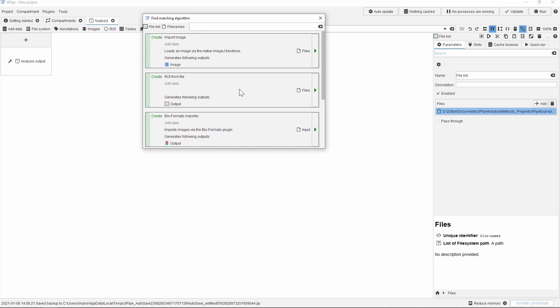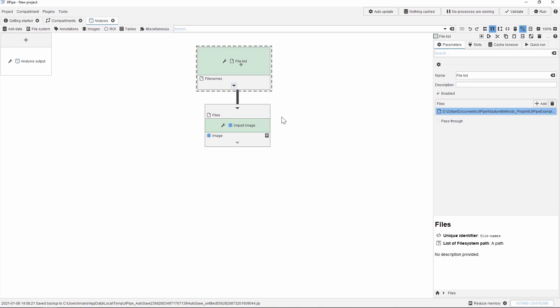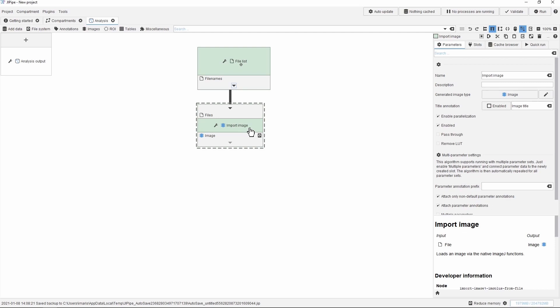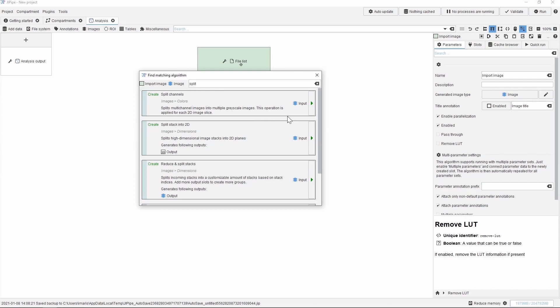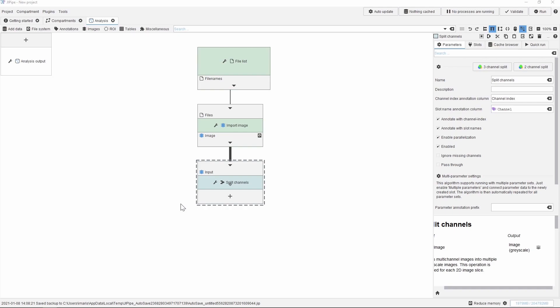When we click on the arrow bar, it will automatically also connect this new node to the previous one. In the next step we have to split the channels, which is of course executed by another node. We look for this using the algorithm finder, we type split and this will give us the first match, again automatically connecting the two nodes.